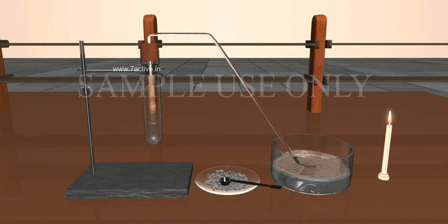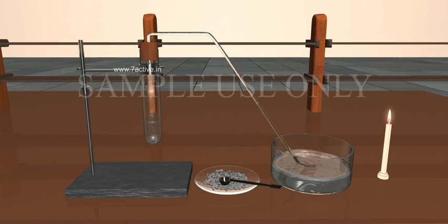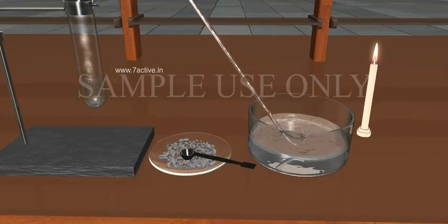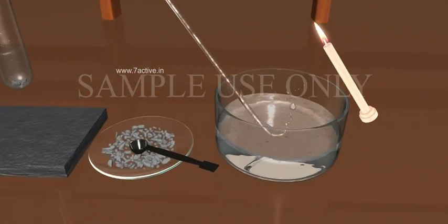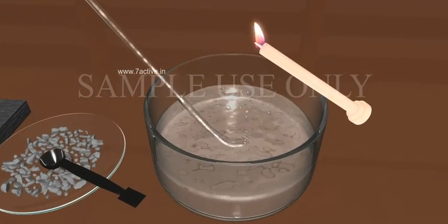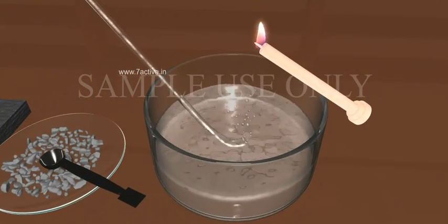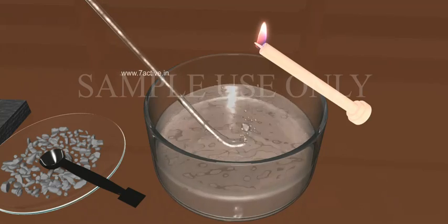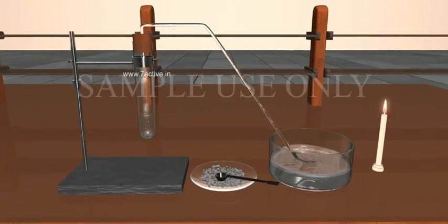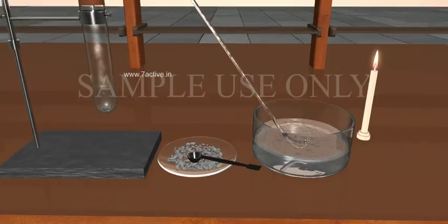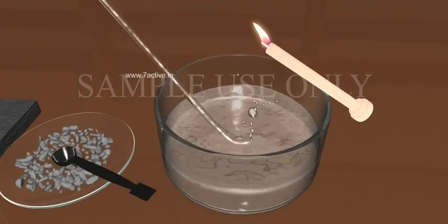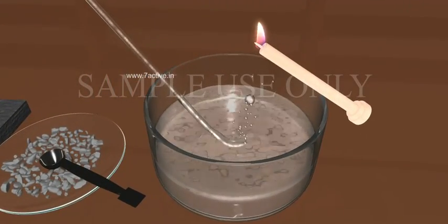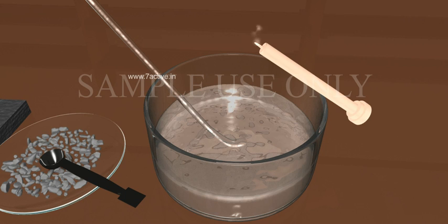As the gas is evolved through the soap solution, bubbles form. Keep the burning candle near a gas-filled bubble. We can observe the burning of hydrogen gas with a pop sound, which is a confirmatory test for hydrogen gas.